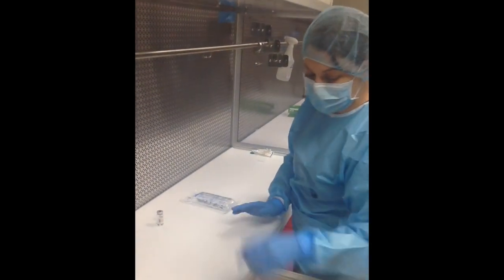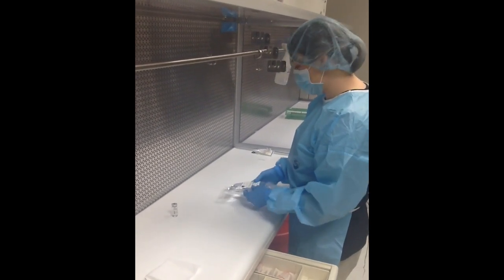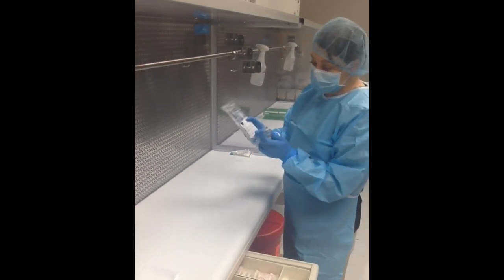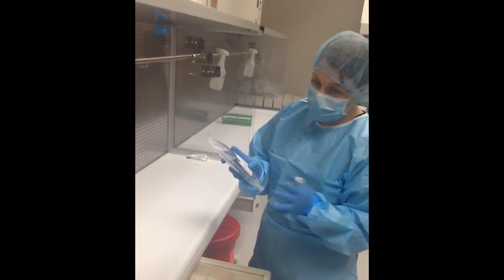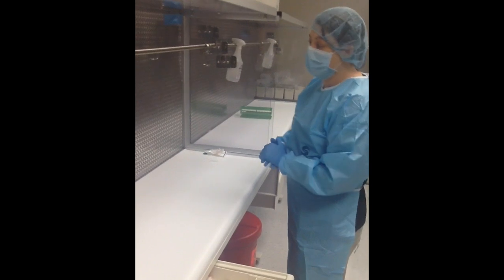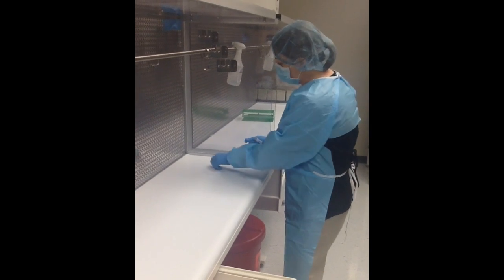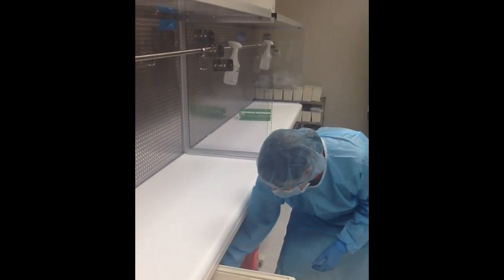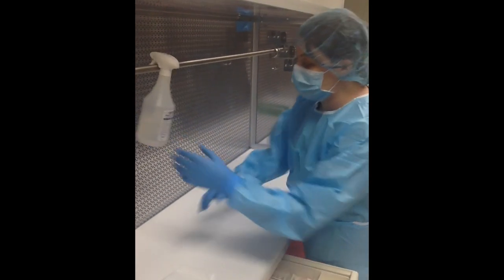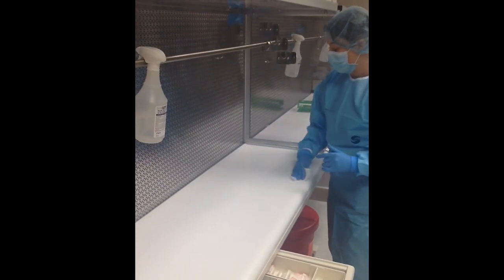Make sure to label the bag — it looks empty now but there's actually a drug in it. You can hand the bag, the label, and the drug to the pharmacist if you're a technician, or if you're the pharmacist, you're ready to check it and have it go out. Before wrapping up, make sure your area is clean. Trash can go in the garbage — do not put it in the sharps container. Then wipe down the area for the next person or before your next product.